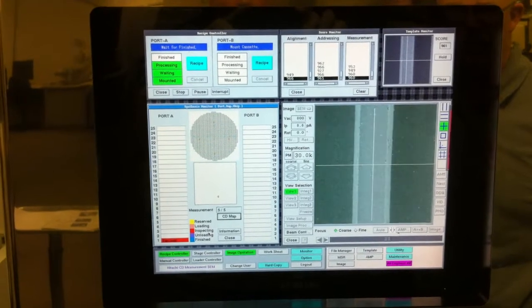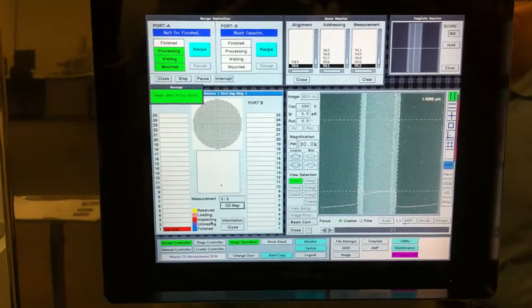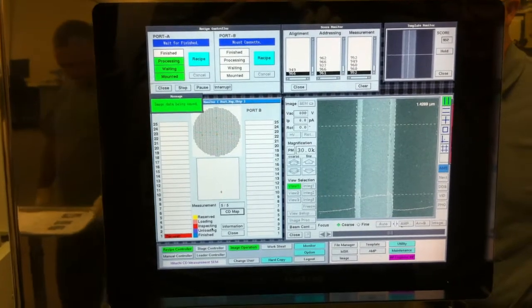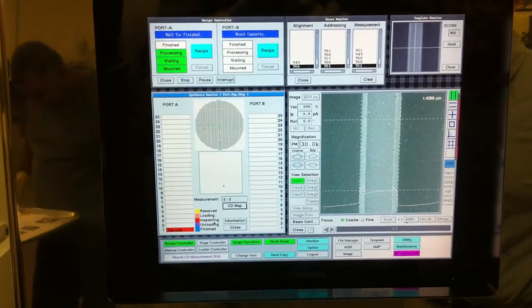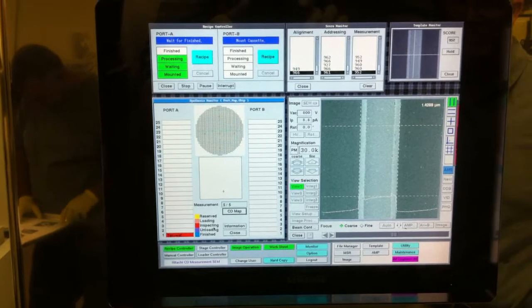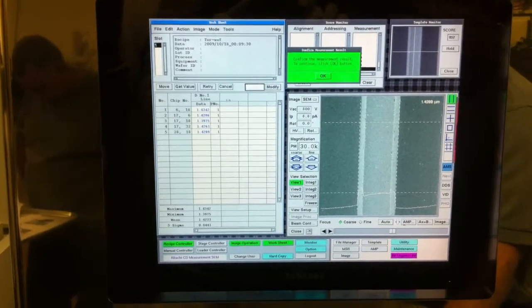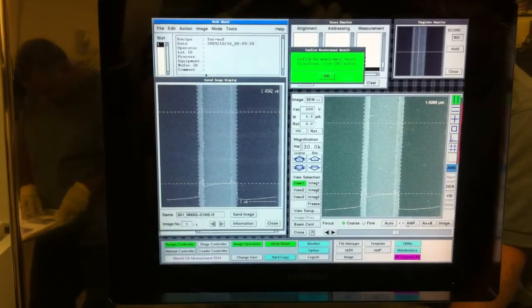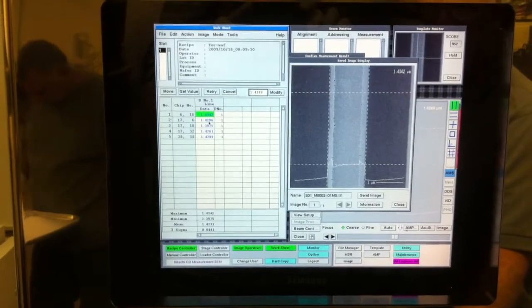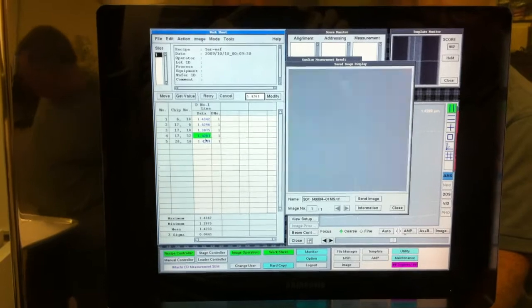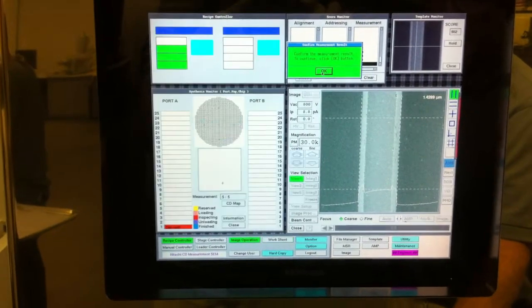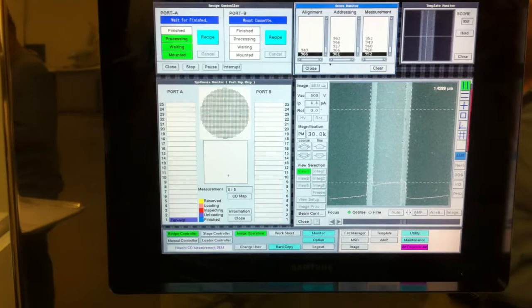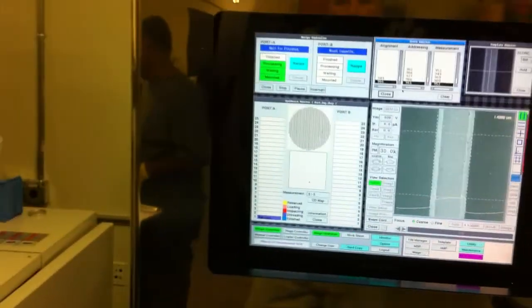Before it pulls the wafer out, it'll display the worksheet. We've selected to do that for some of our testing. We can review the measurements and the images here. And if we're satisfied, we go ahead and say OK, and the wafer will be removed from the chamber and put back into the cassette.